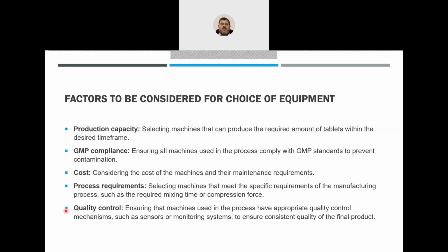Mixing machines. There is a new application now of IR sensors that can give you signals, and then they will process the signal to calculate for you the mixing efficiency, for example, mixing uniformity. We call them in-process controls. But this one is very advanced.